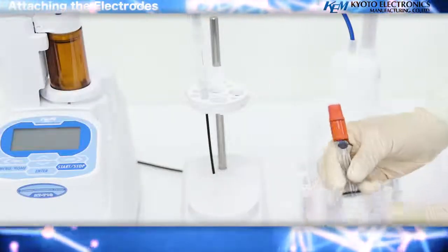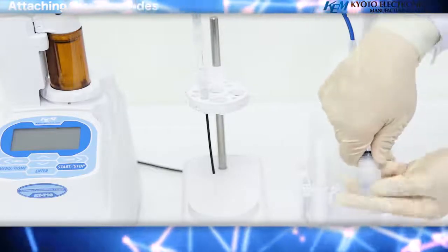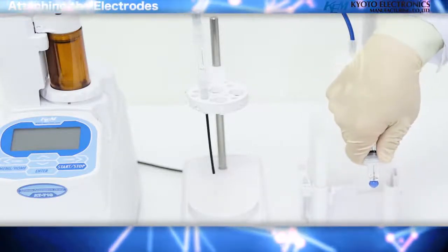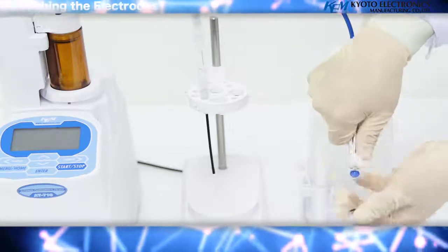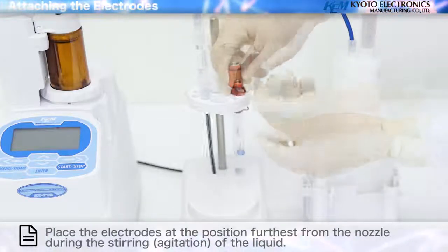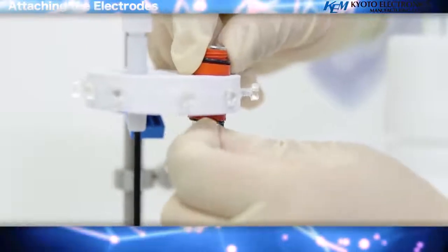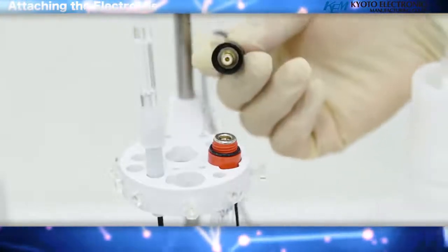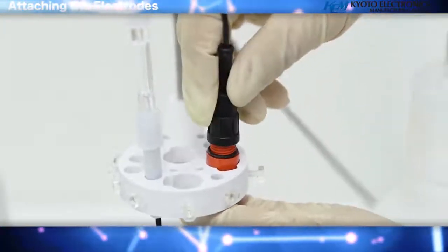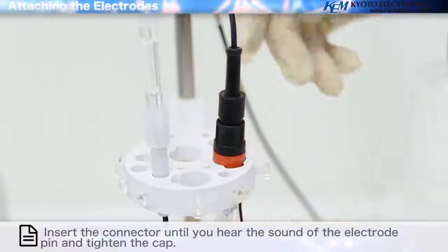Attaching the electrodes: attach each electrode to the electrode holder and tighten the locking screw. Place the electrodes at the position furthest from the nozzle during the stirring of the liquid. Insert the connector until you hear the sound of the electrode pin and tighten the cap. Adjusting the lever at the bottom of the electrode holder adjusts its vertical position.